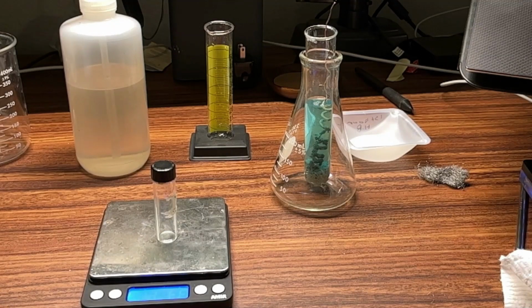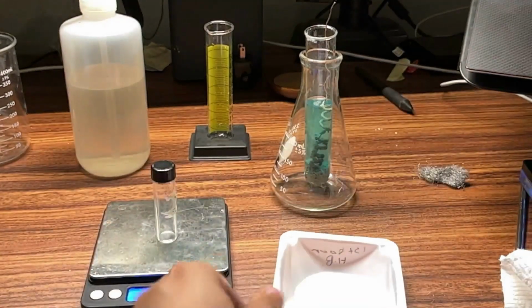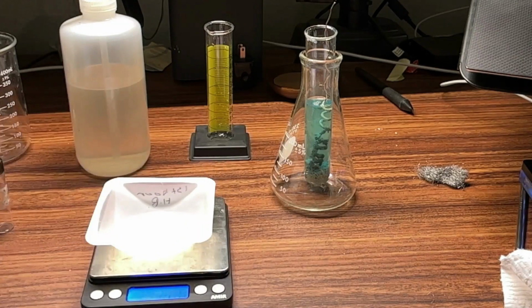All right, the other, 9B, is to get a plastic weigh boat, label it with your name. I don't need to label it because I'm the only one here. Find the mass of the weigh boat, so we do need that. It's 2.39 grams. Again, I don't think you can read that, but it's 2.39 grams.